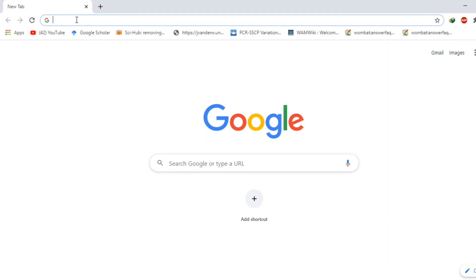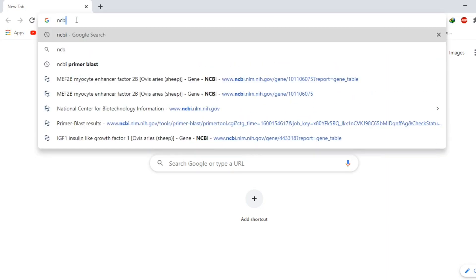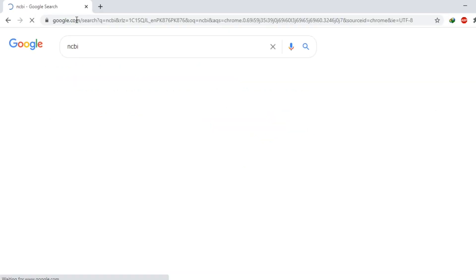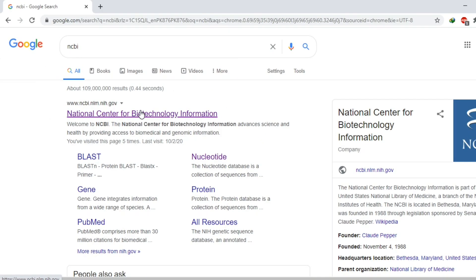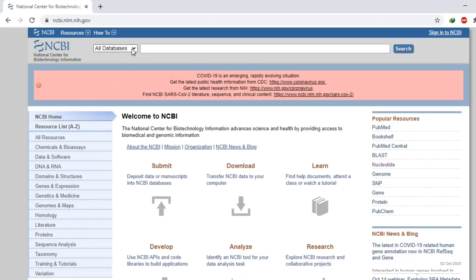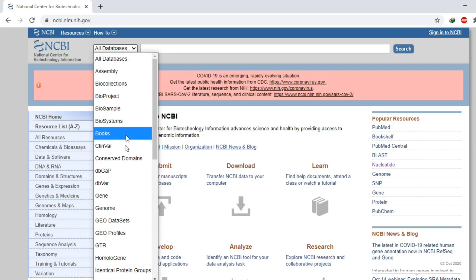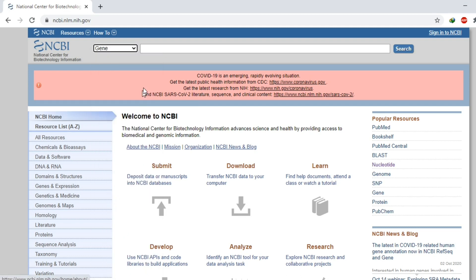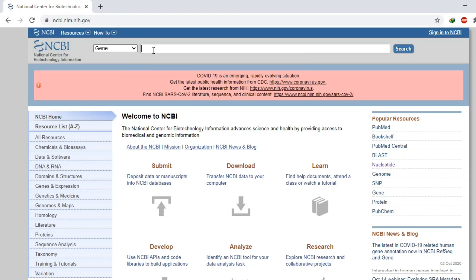Let's start. Search NCBI, click on the link, and we will select Gene. I am going to search for Myocyte Enhancer Factor 2B, which is commonly known as the MEF2B gene. I am interested in the organism sheep, so we will search MEF2B gene of sheep.